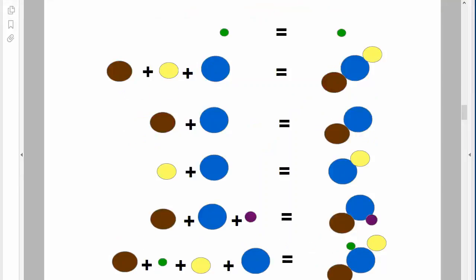The really useful partitions are partitions where the combinations of subfragment masses account for masses of multiple fragment ions. Scoring is based on how many fragments can be explained by various combinations of subfragment masses, also taking into account how intense those fragment ions are.